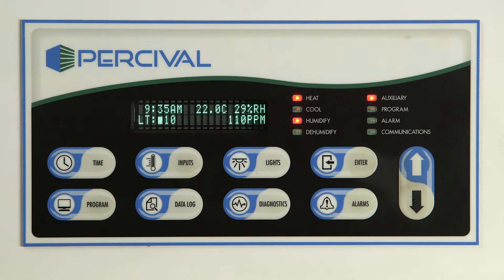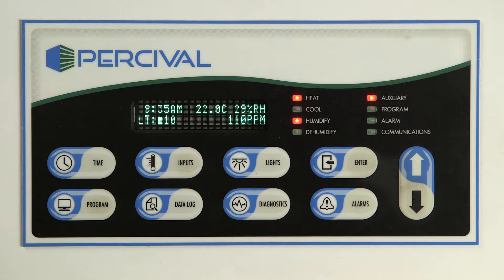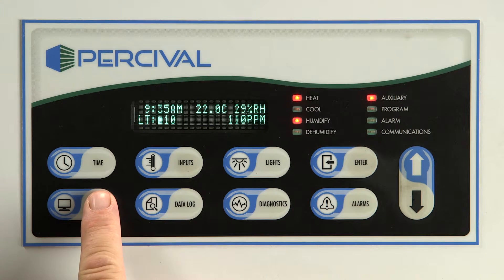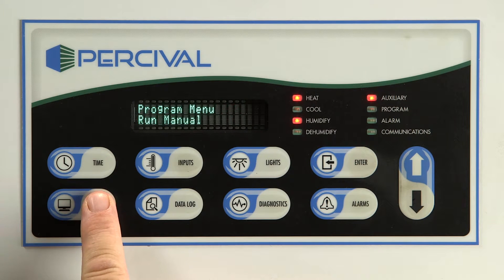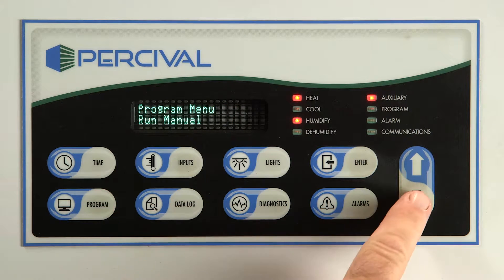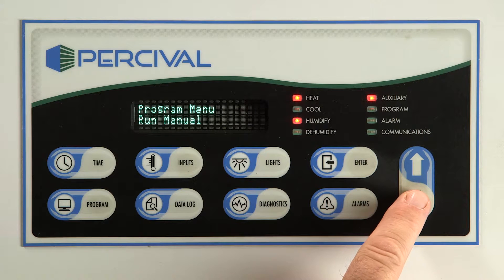The Intelis Ultra Controller has four program types. 1. Diurnal programming is a simple, two-step, 24-hour light and dark cycle. To set a diurnal program, follow these steps.